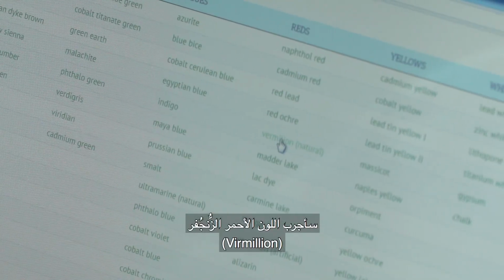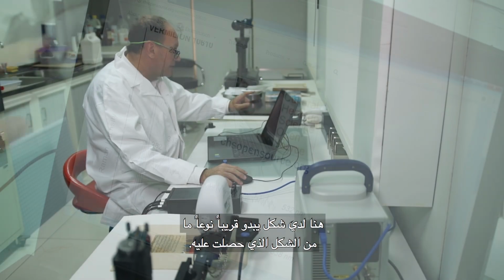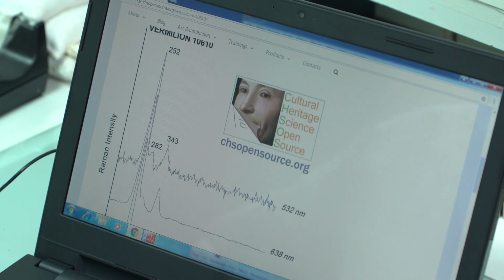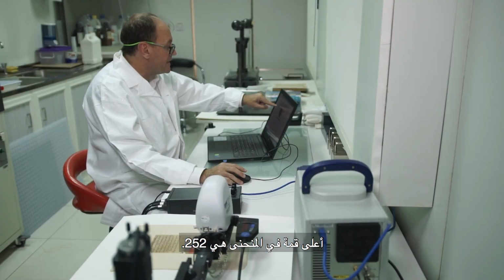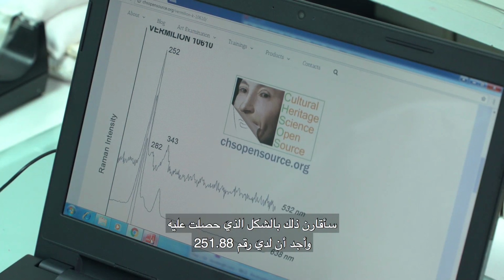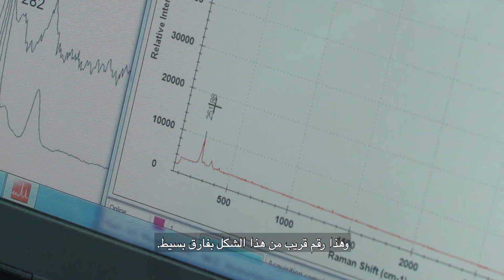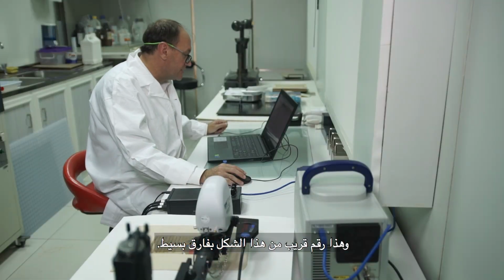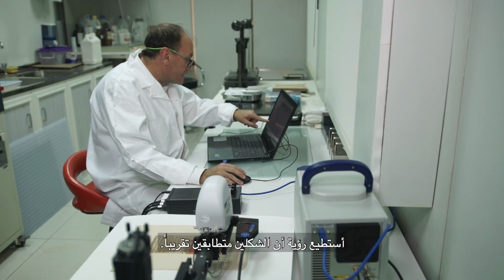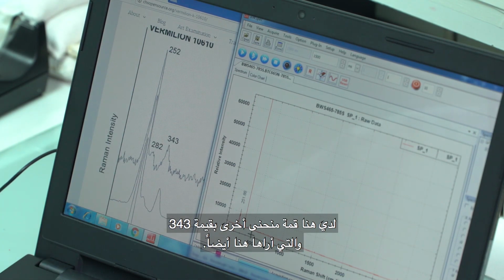I will try now the vermilion, and I look at the result of the vermilion. And here I have a spectrum which looks quite close to my spectrum. So the peak, which is the highest point of the spectrum, is 252. So now I will check with mine, and you have 251.88. So that's the same, give or take a few digits. And I can see it's exactly the same here. I have another peak at 343, which I get here.